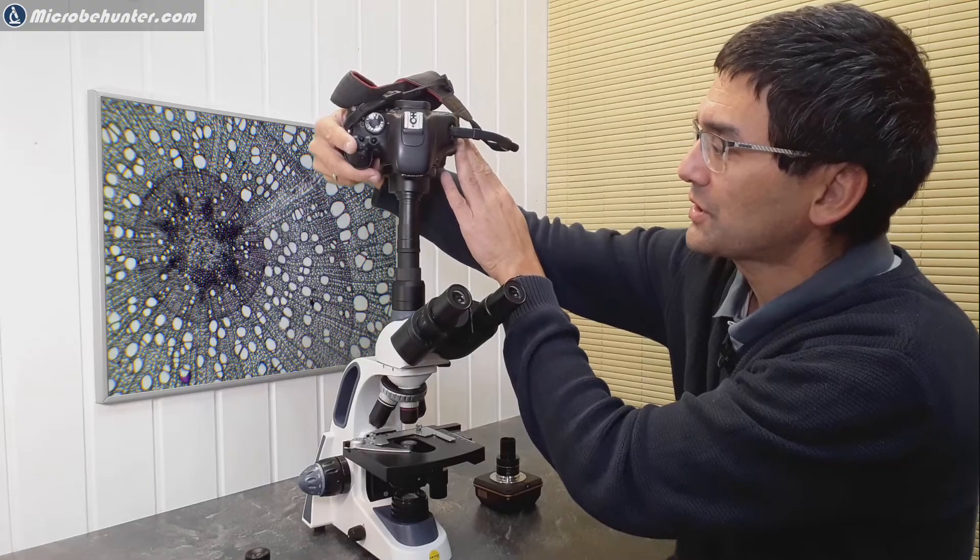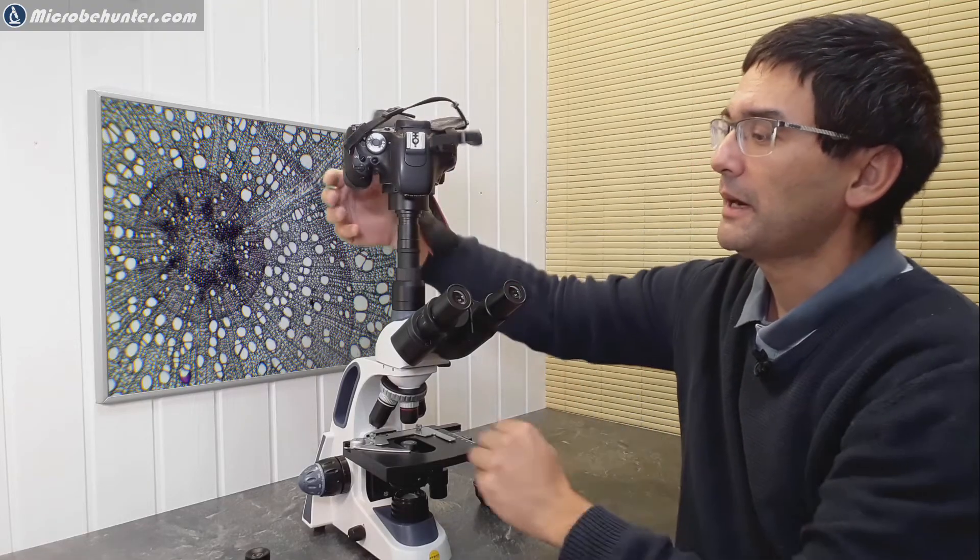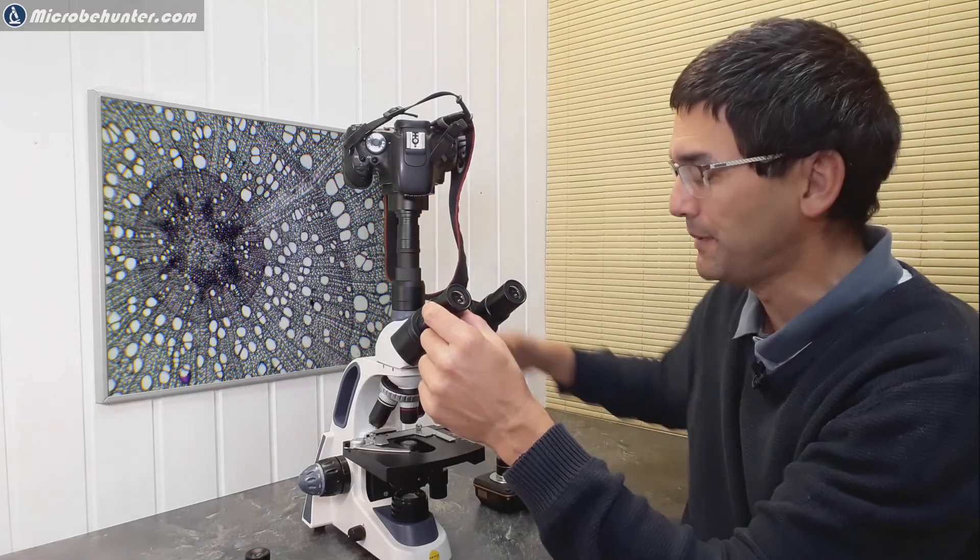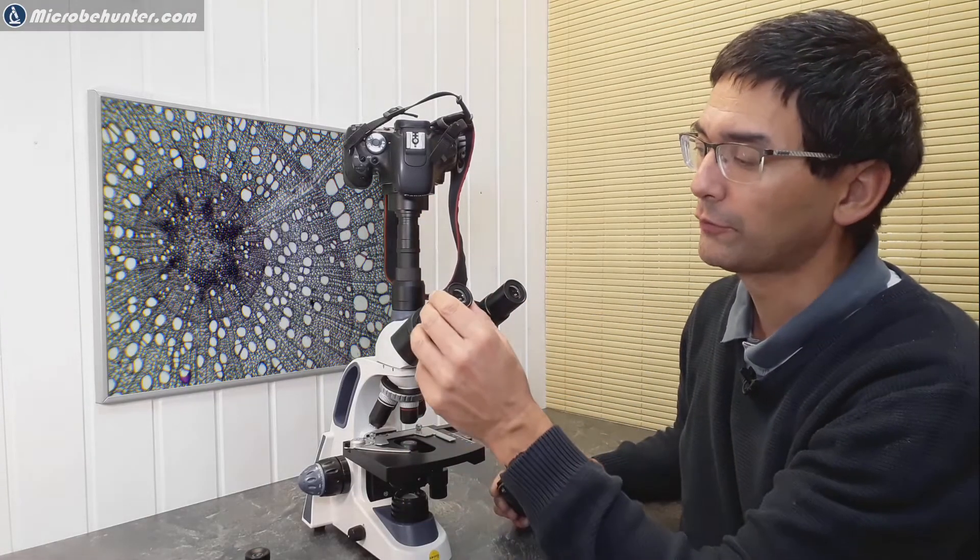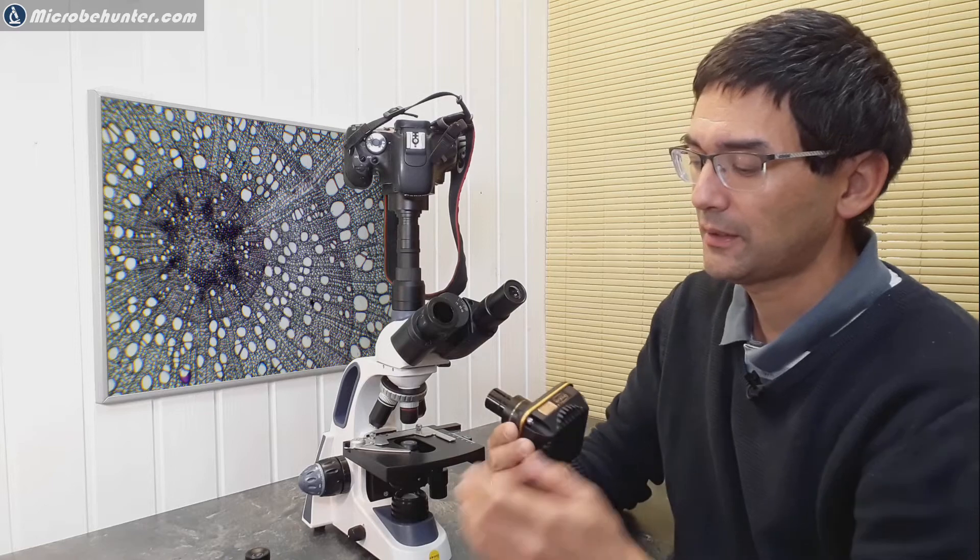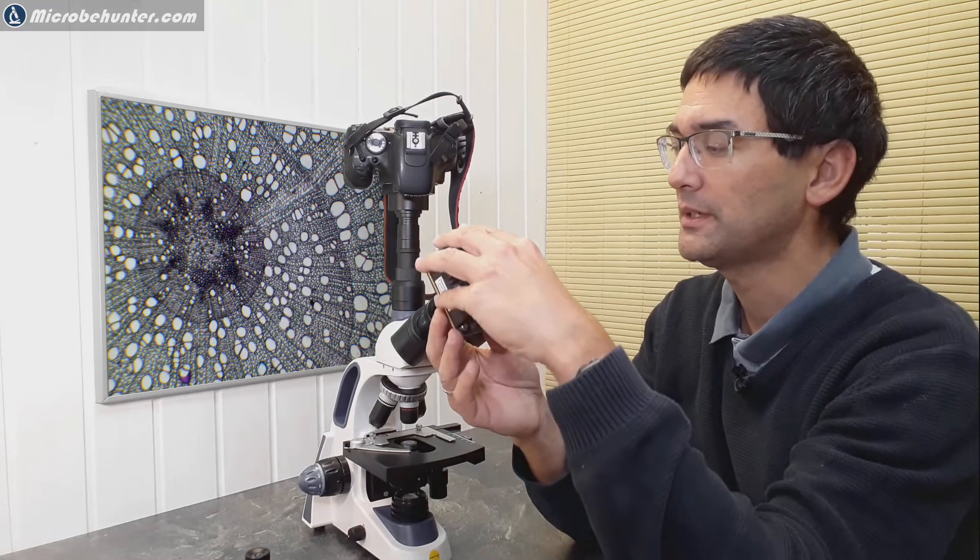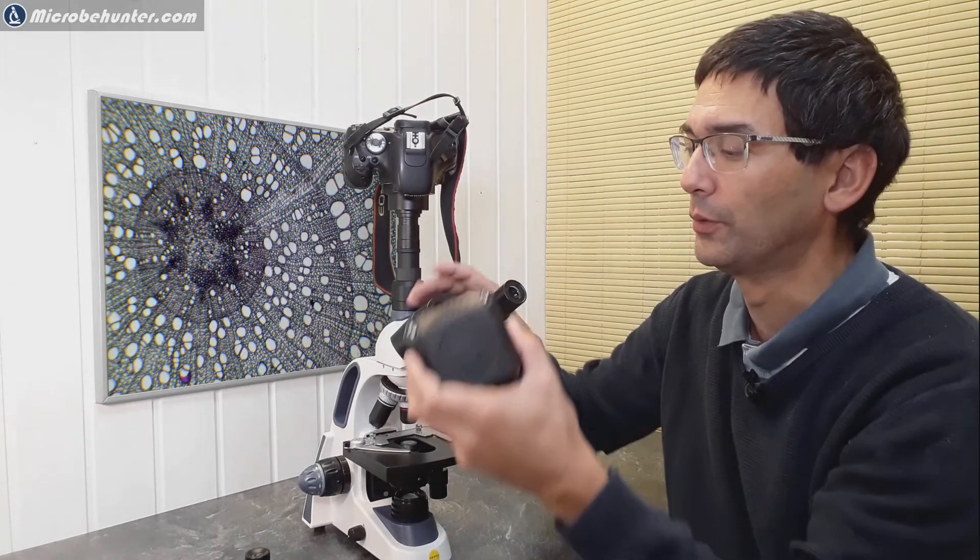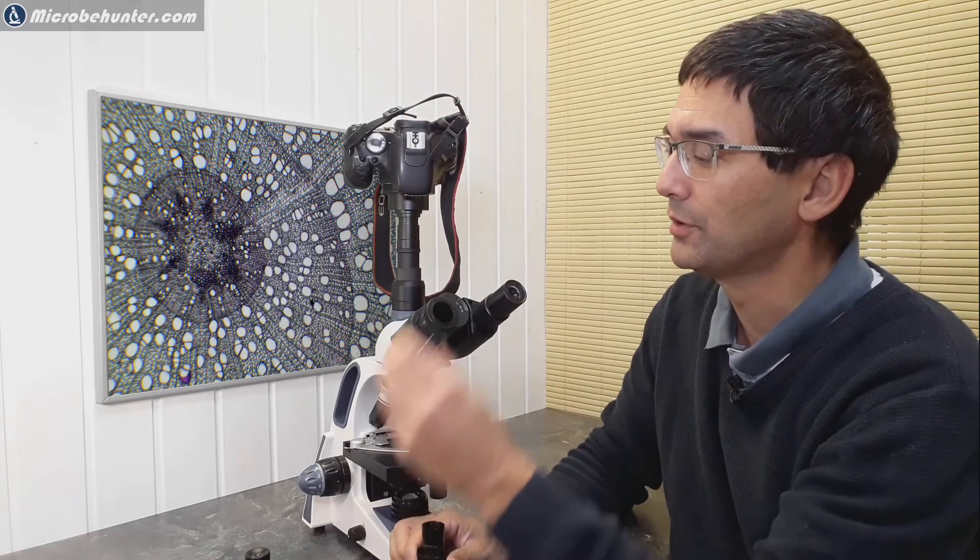Of course it might be a little bit too heavy if you want to connect it instead of one of the eyepieces. If you've got the binocular version, then you can connect the camera also here instead of one of the eyepieces. This of course works, however a DSLR might be a little bit too heavy for the whole thing here.